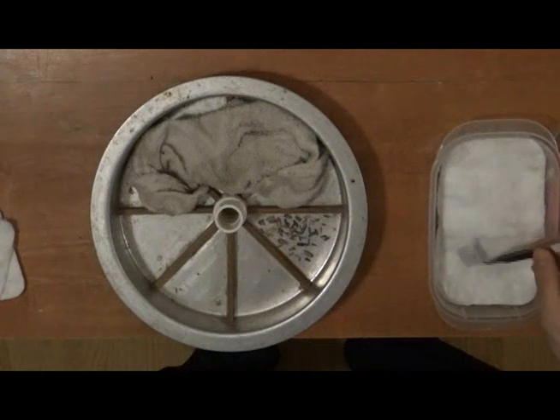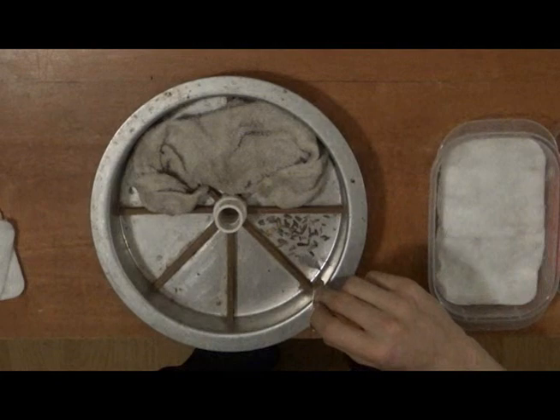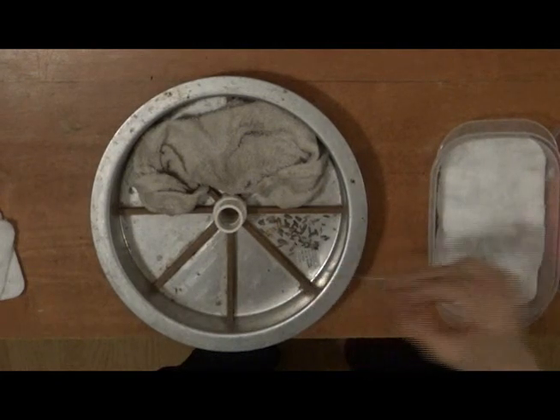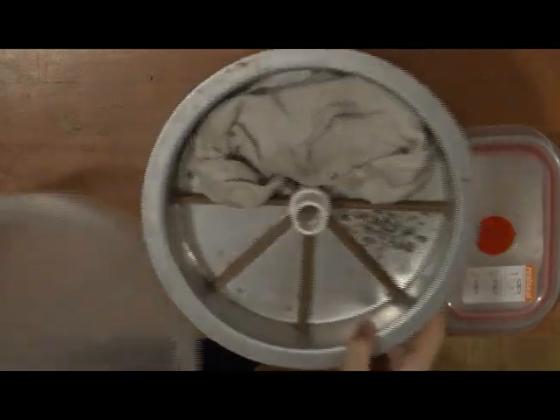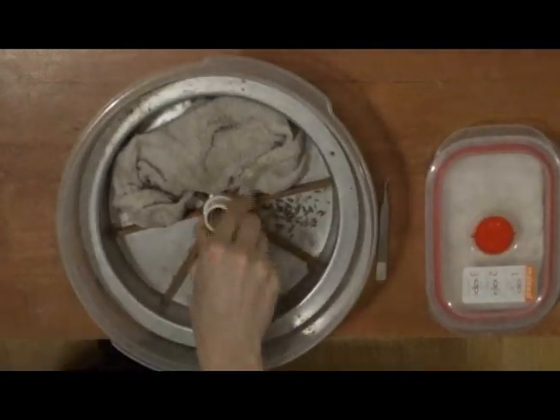I carry the data label over with the moths. After putting the tray in a Tupperware container and tightly closing the lid, the moths should be relaxed and ready to spread in 12 to 24 hours.